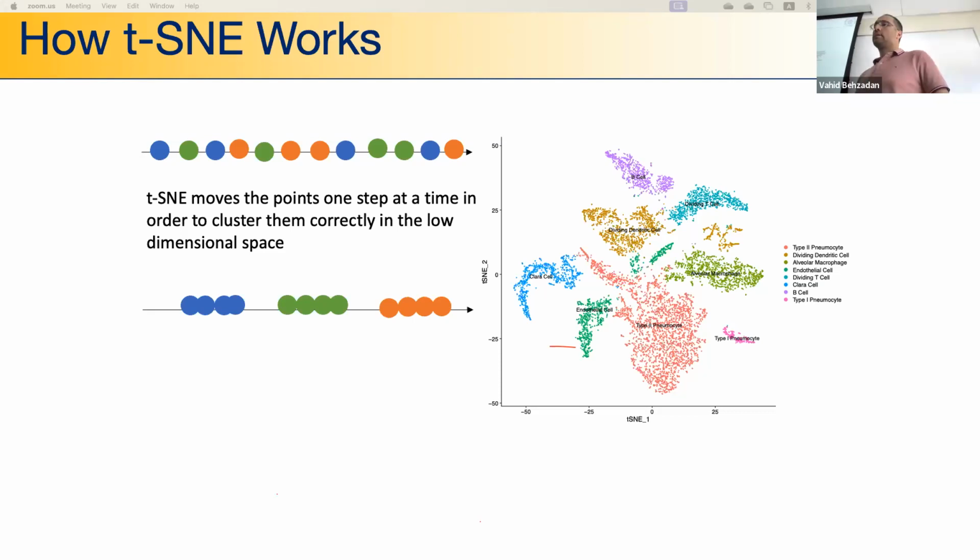So it's not just banking on the rule of large numbers. It's banking on the nature of the problem, the nature of the biology that you have, because when you filtered out these cells, you know that these are dying cells or bad samples, right? And what you end up with is good quality cells.